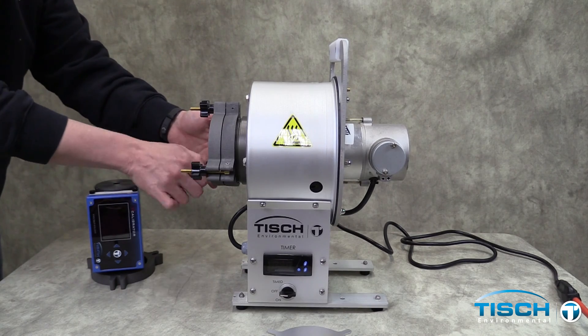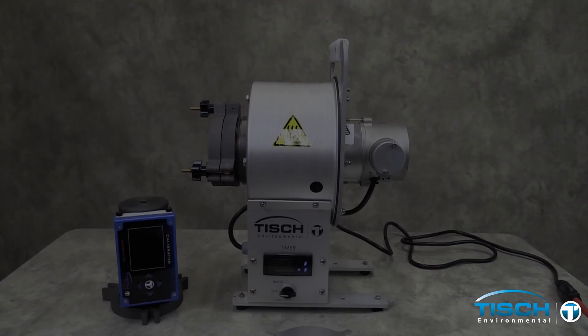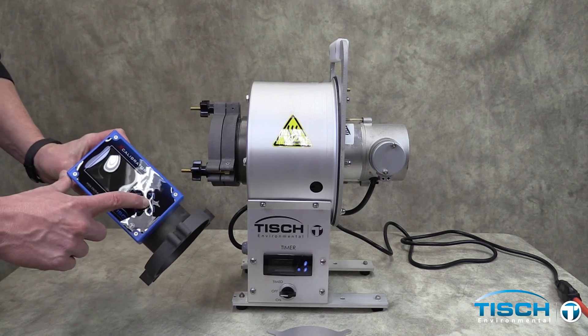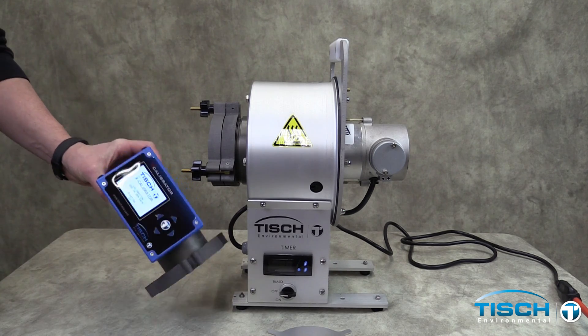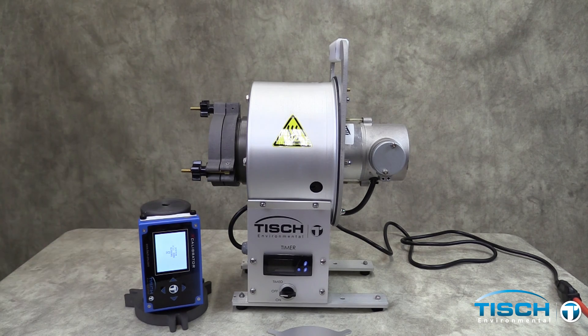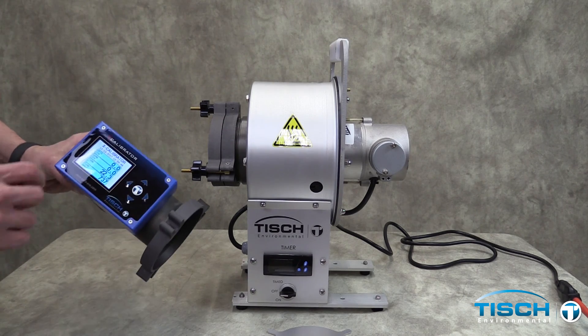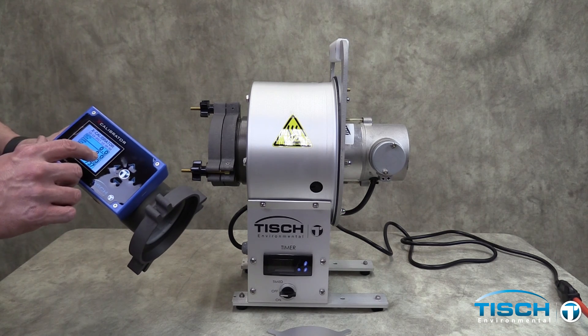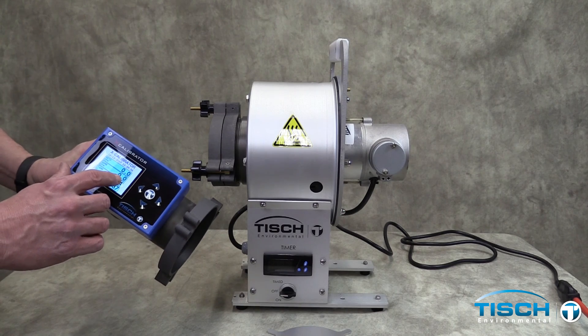Now you are ready to run a sample. To calibrate the unit, first turn on the calibrator by holding down the main button. The calibrator will warm up and will zero. The first number on the calibrator screen reads standard flow. The second number is the actual flow — you want to read this number.